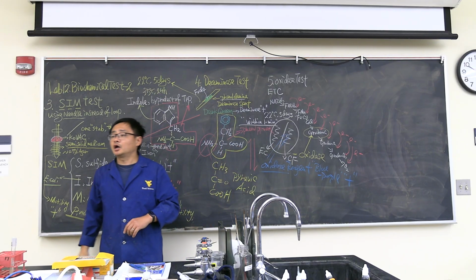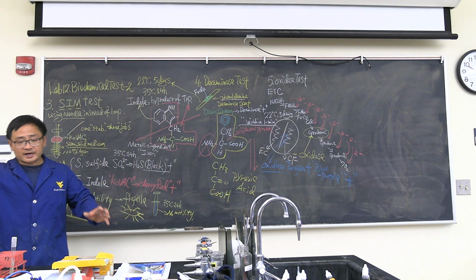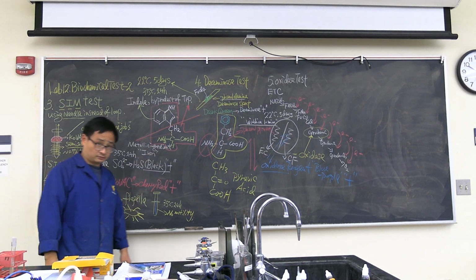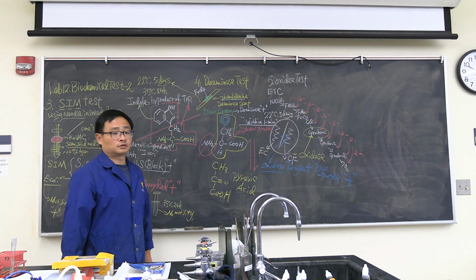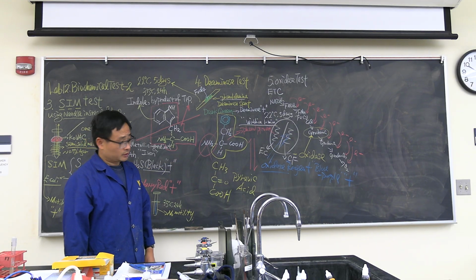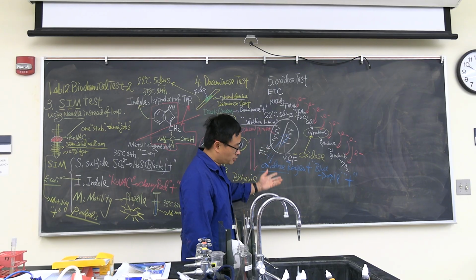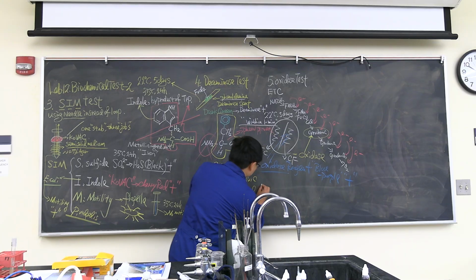Why? Our environment has oxygen. If you open the agar plates exposed to the air about like 5 minutes, everything turns false positive. Because we have air. We have oxygen in the air. Okay? Now, why oxidase test is important? This is used to differentiate an important soil bacteria, also spoilage bacteria, to the other group of the bacteria.